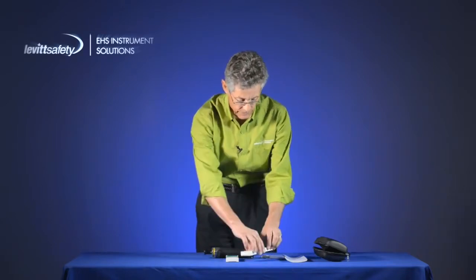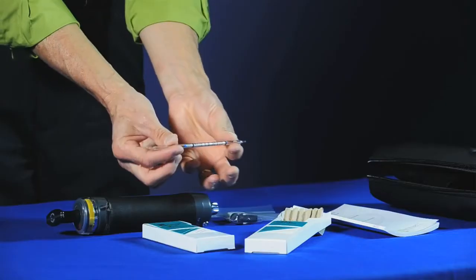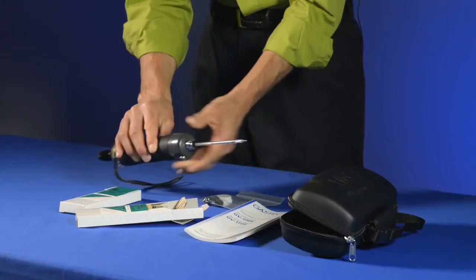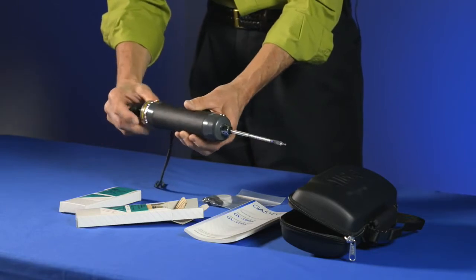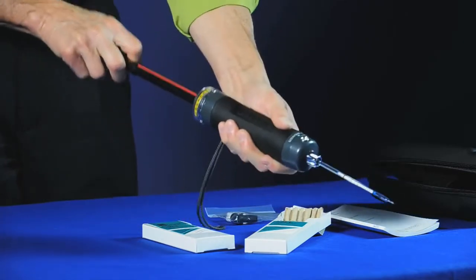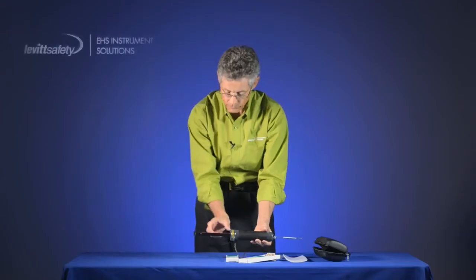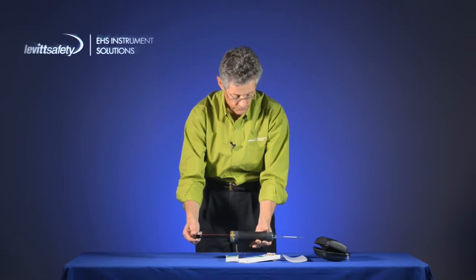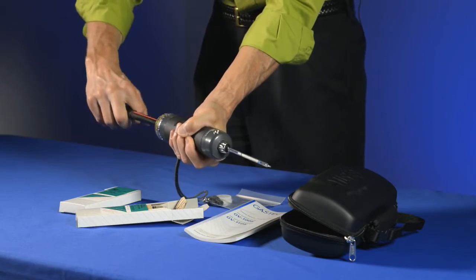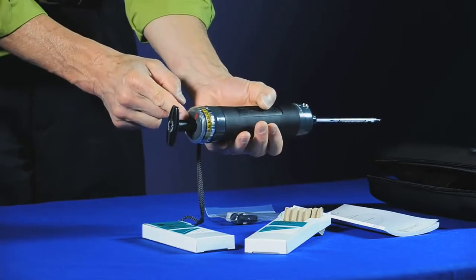There are a couple of things we have to do with detector tubes prior to use. One is to do a leak check. A leak check involves using a box of an unbroken tube, inserting it into the front end of the pump, resetting the stroke counter, lining up the 100cc mark, and drawing out until it comes to a full click stop. At this point we wait for one minute, then check to see if the vacuum is still intact inside the pump by grabbing the handle and body firmly and giving it a quarter turn — it should draw the handle back to its original starting position.